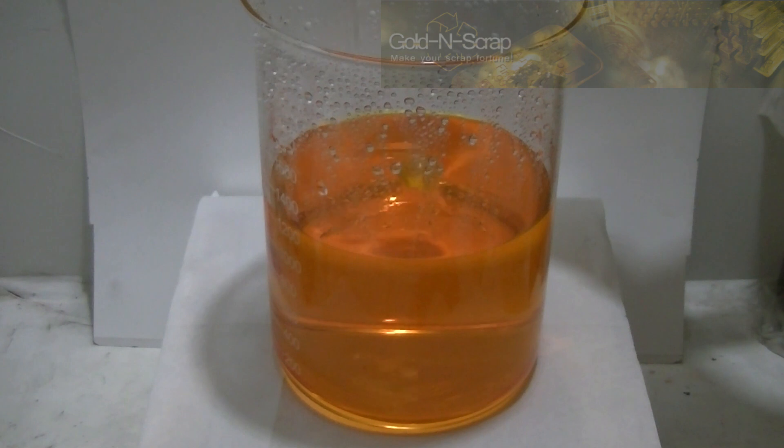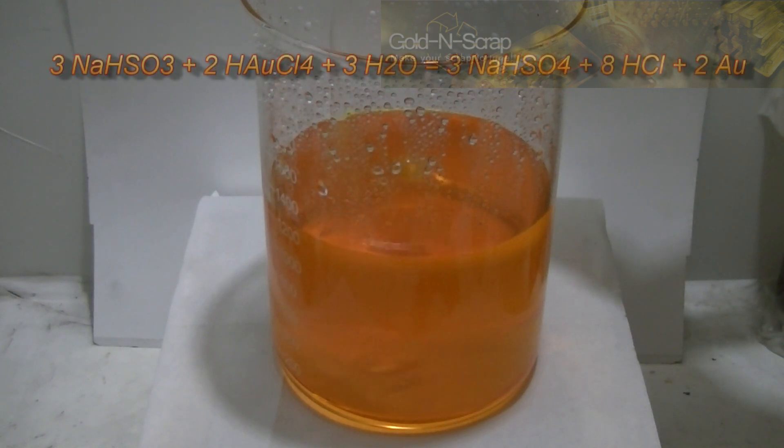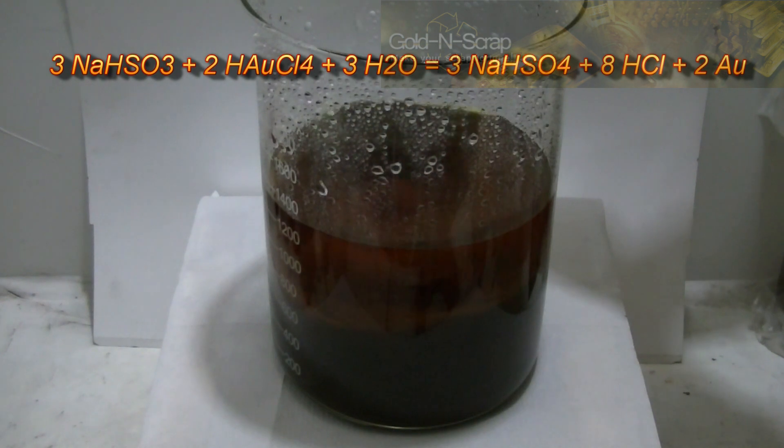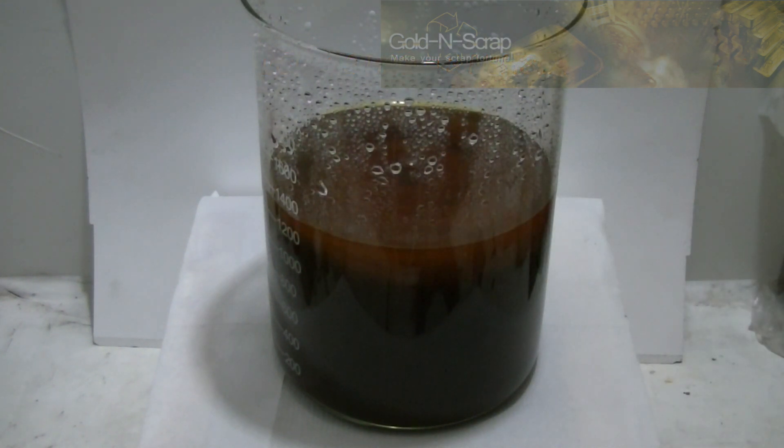The SMB is first dissolved in water and then added to a stirred gold solution. The SMB will react with the gold ions in the solution and reduce it to metallic gold powder. As a result, some sulfur dioxide gas will release. It is pretty toxic so the reaction must be done under a fume hood. By the way, you don't really have to use a magnetic stirrer like in this video. It is just my personal favorite.